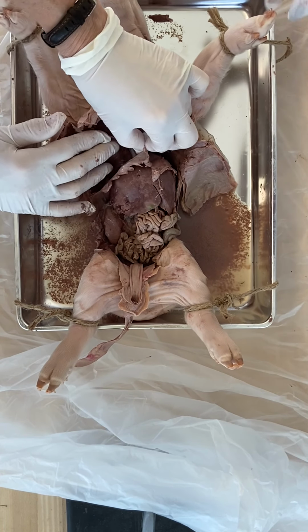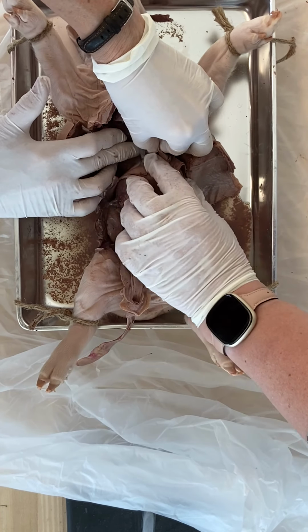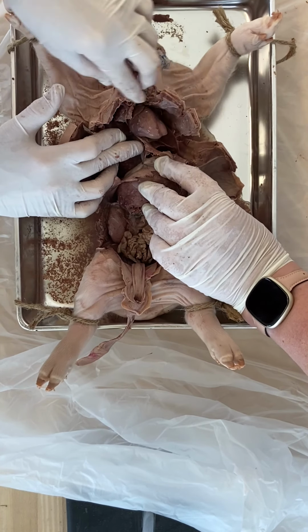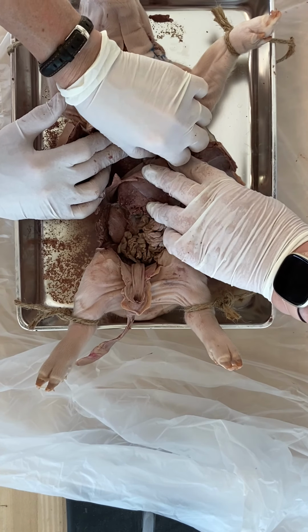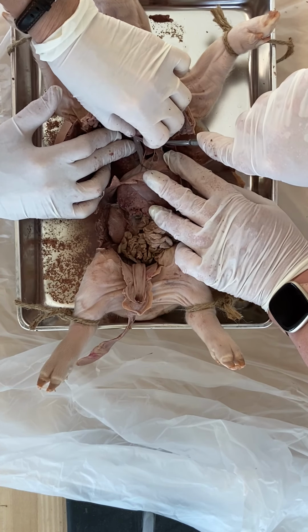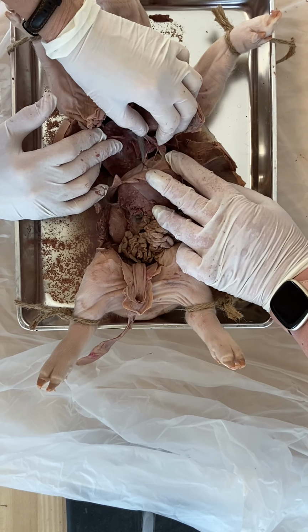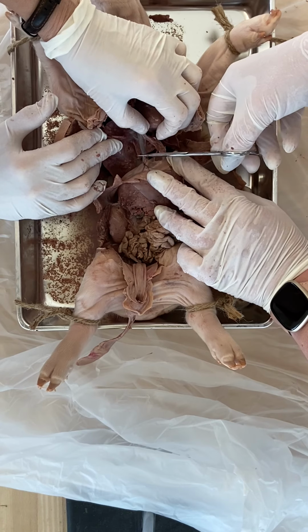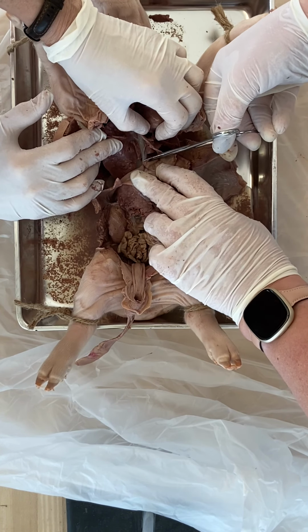So I'm looking here as this goes down. I think this right here, I'm trying to decide, is that the esophagus or is that the descending aorta? Oh, okay, yes. I don't know which one it is. I'm not going to cut it. I'm just going to move. Yeah, you can go and cut it. Let's cut that. So is this the descending aorta or?